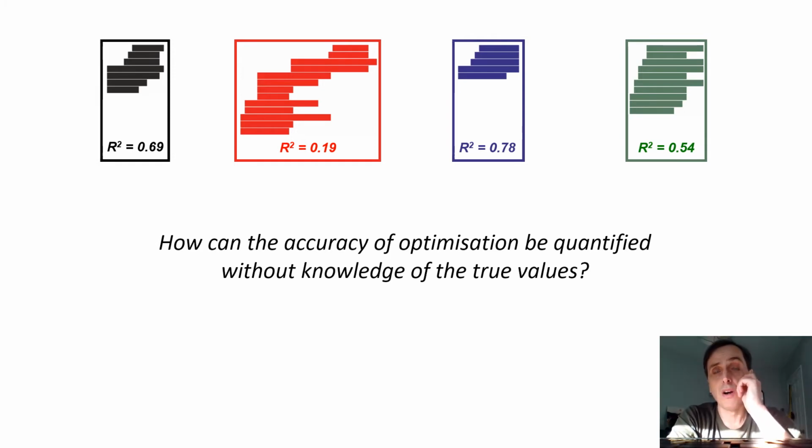And so for this we developed a novel method. This is, I should also say, a general problem with any kind of optimization method: how can you ascribe confidence to the outputs. And when we started looking at this, we began by looking at the experimental data.